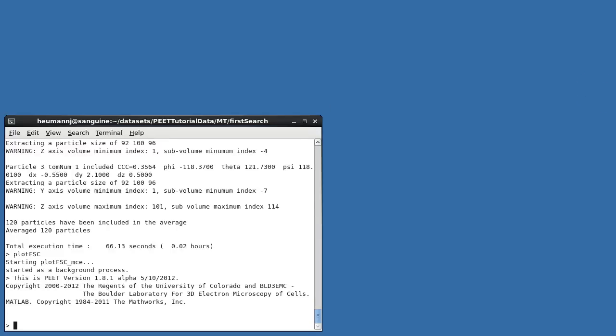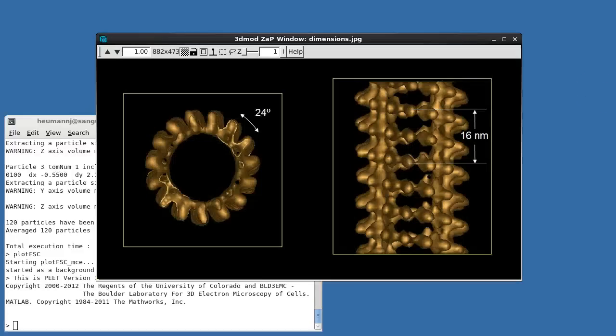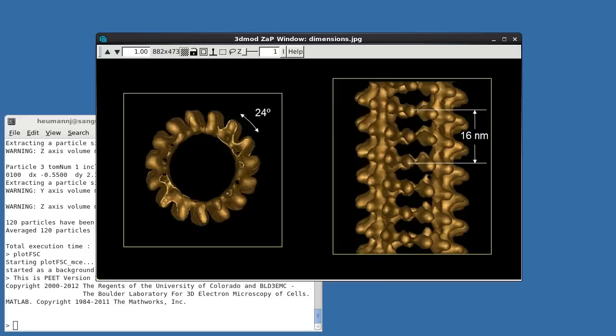These averages suffice to verify that this is a 15-protofilament microtubule. Here's an illustration of this structure overlaid on our current average. The kinesin-5 decorated beta-tubulin subunits are visible as the prominent spikes sticking out from the cylindrical core. Notice that there is a 24-degree axial rotation between neighboring spikes, as well as a vertical displacement of 16 nanometers divided by 15.